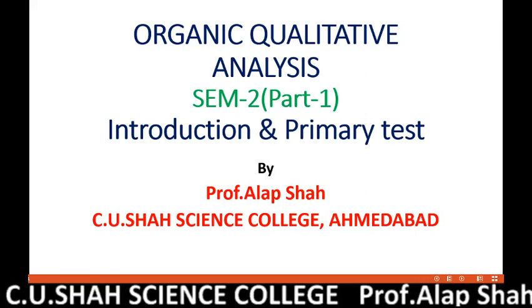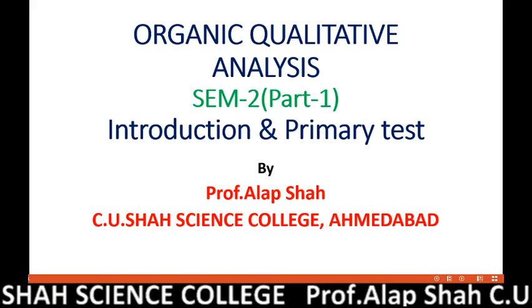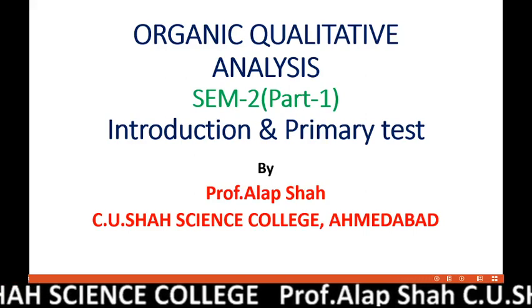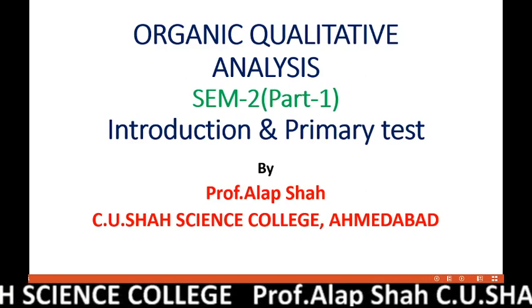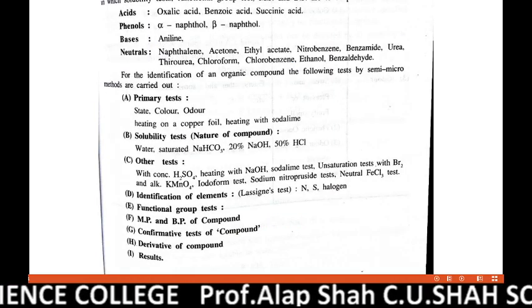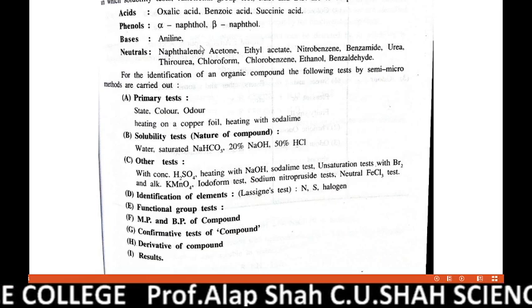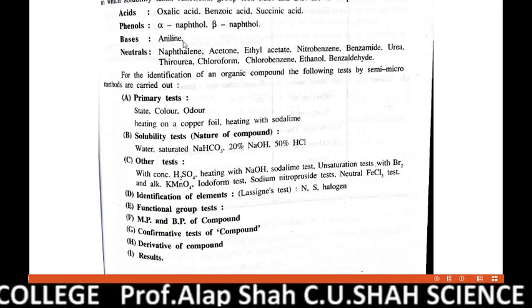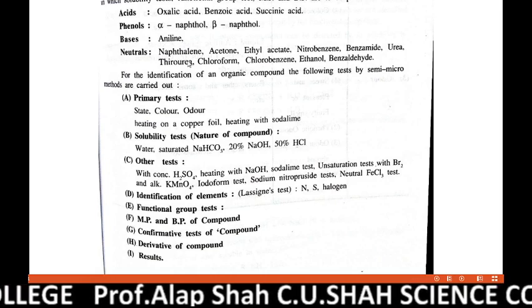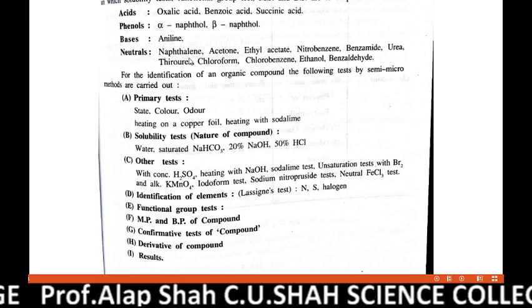Hello everyone. In this video, we will discuss organic qualitative analysis for semester 2, Gujarat University. Now this is the curriculum. Some acids: oxalic, benzoic, succinic, these phenols. The only base in your curriculum is aniline, and certain neutral compounds are given to you.